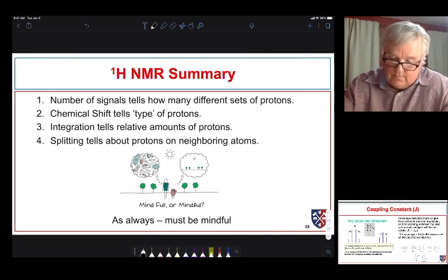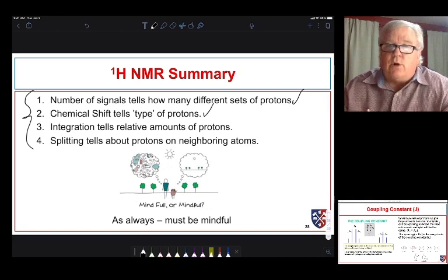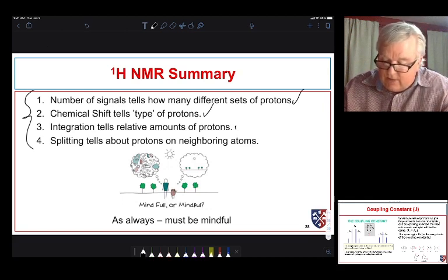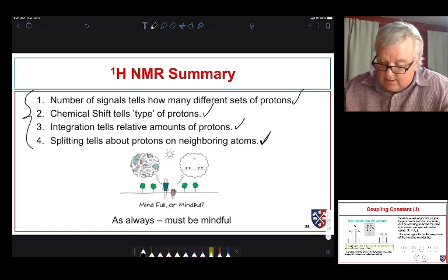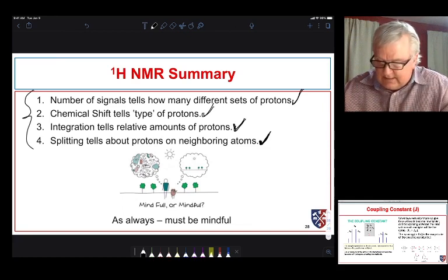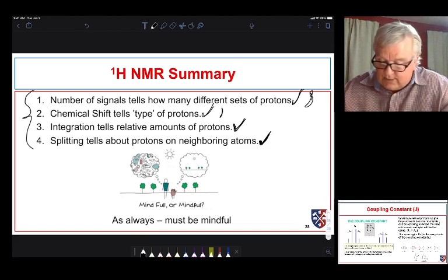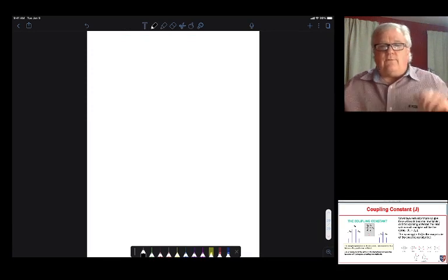So here we go this is a little bit simpler. The four types of information we get from NMR: the number of signals tells us how many different sets of protons we have, the chemical shift tells us the types of protons we have, the integration tells us the relative amounts of protons we have, and the splitting tells about protons on neighboring atoms. So keep this in mind when you're looking at NMR spectrum that there's four types of information and go through it stepwise. The first thing to see is how many signals we have, the chemical shift will tell us the types of signals and if we have a molecular formula we can have some idea, the integration tells us the relative amounts of protons, and the splitting tells us what's on the neighboring protons.